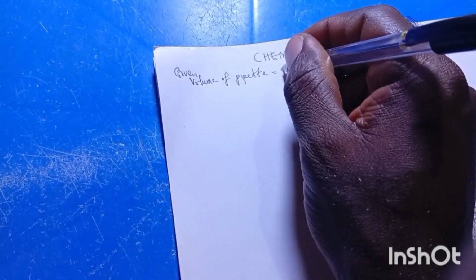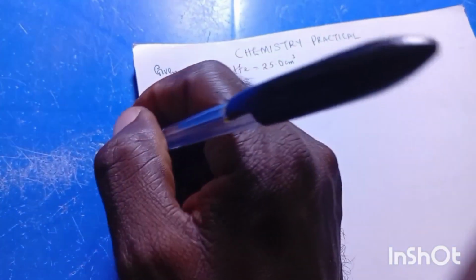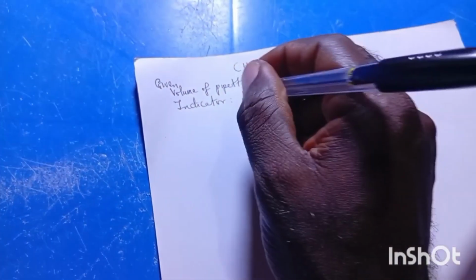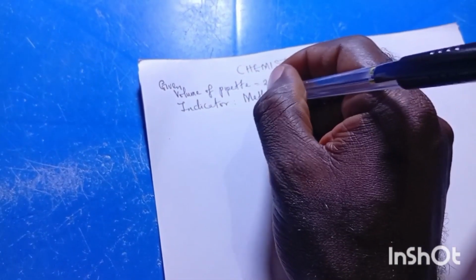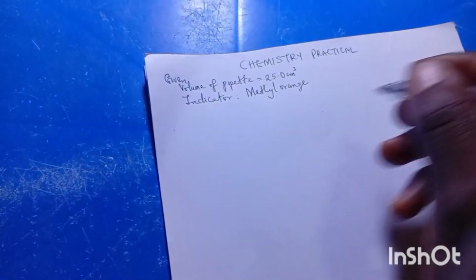I'm using 25 cm cube. And for my indicator, I am using methyl orange. We've known that one. And likewise, now I can go to my table of values.